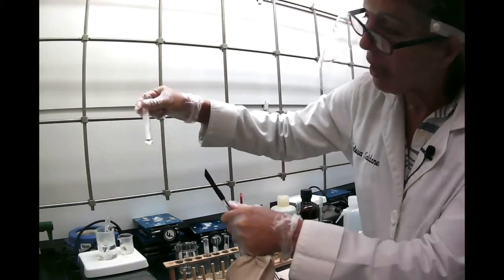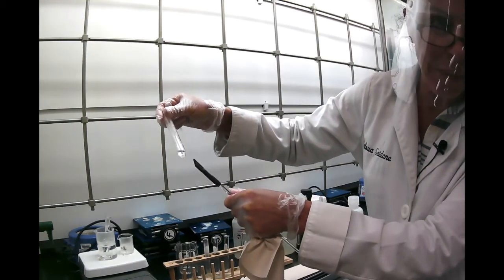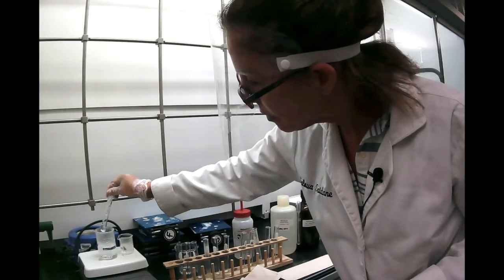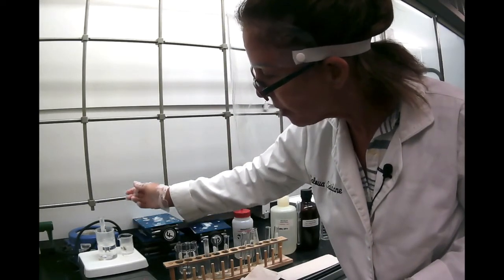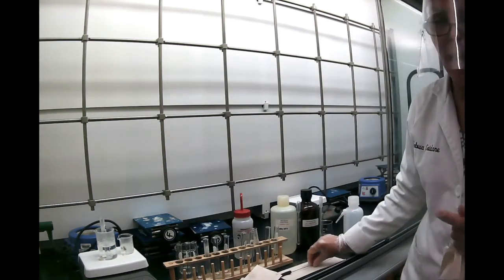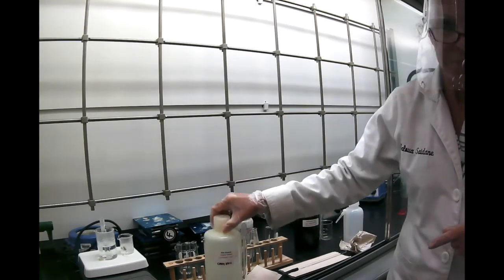The acetanilide looked like it dissolved, but we have some kind of impurity down here, but it dissolved in hot water. Benzoic acid needs a little bit more heating, I guess, because we needed a little bit more water in there. We'll wait for that, but then in the next step, we're going to do the same thing with ethanol.